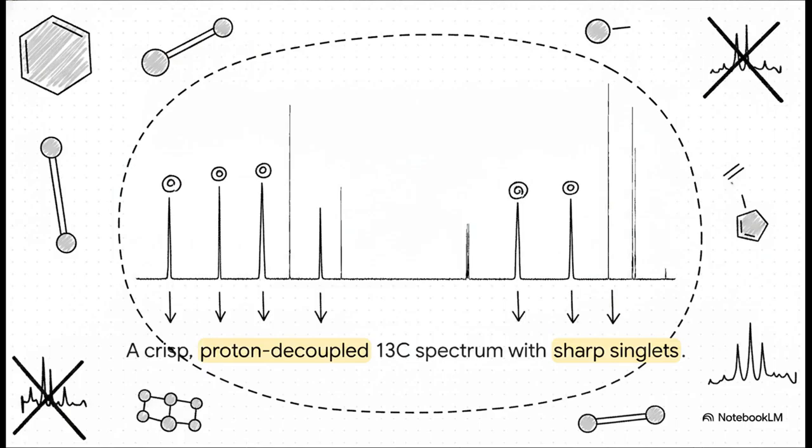When you look at a real carbon-13 NMR spectrum like this one, the first thing you'll notice is just how remarkably crisp it is. Instead of those complex, clustered multiplets you have to untangle in proton NMR, we just have this nice, neat series of sharp, isolated spikes, or singlets. It makes counting the number of unique carbon environments in your molecule so straightforward.